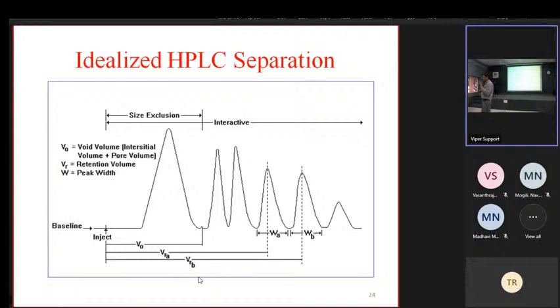documentation. If you are doing any new kind of method development, then you have to try with different mobile phases. For example, the method contains a 1:1 ratio of water and methanol. How do you know the 1:1 ratio? Because it is already done, already published, already somebody has developed that method. They have reported the 1:1 ratio. When you are doing it for the very first time, you have to do trials, based upon the chemistry of the molecule.